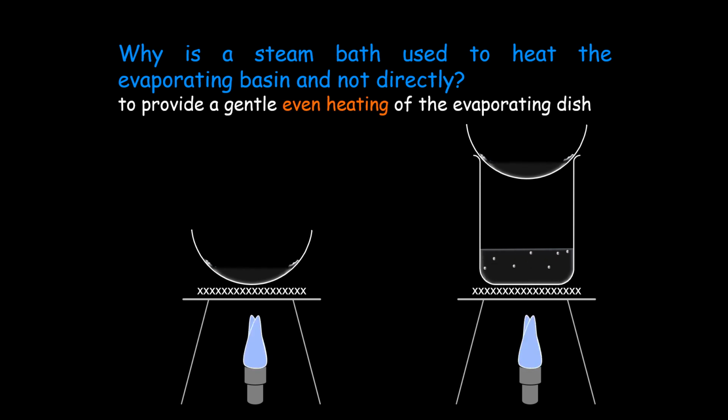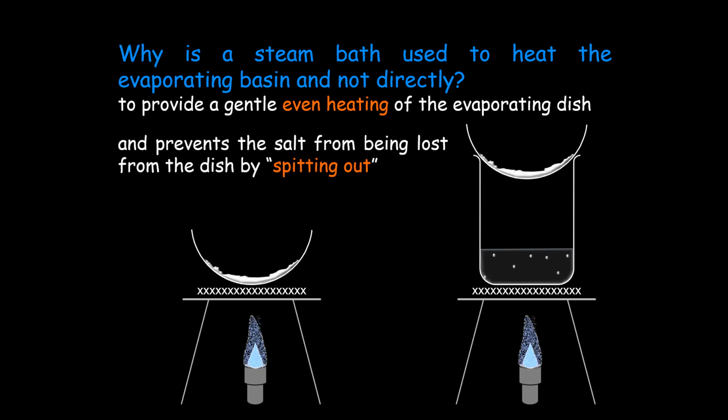To provide a gentle, even heating of the evaporating dish, and prevents the salt from being lost from the dish by spitting out.